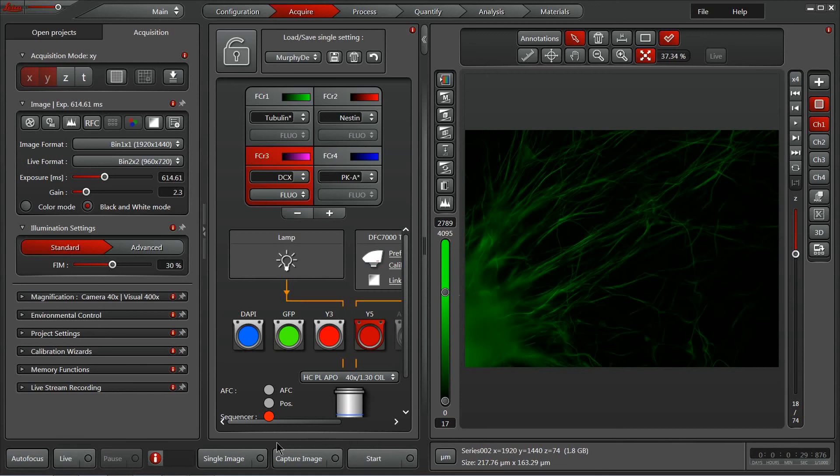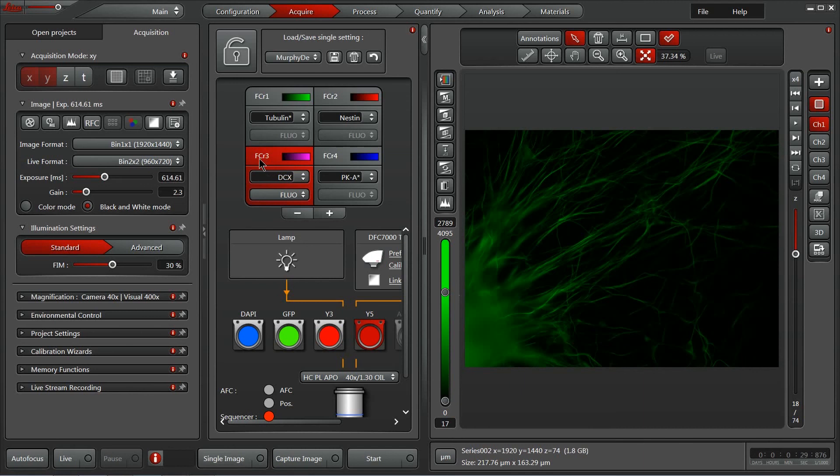Across the bottom of the center panel, we have three different acquisition choices. We have a single image capture, which will take a single channel that you have selected only. So it will ignore the additional channels as well as the additional dimensions that you have selected as part of your experiment.